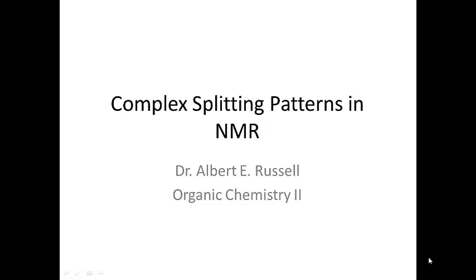So in preparation for our discussion tomorrow, we're going to look really quickly at some complex splitting patterns in NMR. Let me just say off the bat that this is not meant to be exhaustive. There are volumes and volumes of books that discuss this particular topic, but I just want to touch on a couple of things, namely complex splitting as it relates to AMX type systems, and complex splitting as it relates to diastereotopic protons.